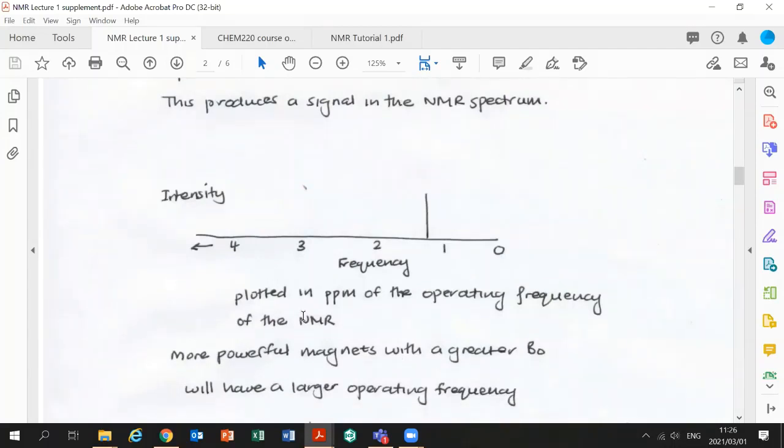So that long-winded story that I just told you just means that that's how I get a particular signal in the NMR spectrum. This arises from a proton that's excited to the beta state, relaxes to the alpha state. I get the data in terms of the free induction decay, which tells me how the energy changes over time. I convert that to a frequency in hertz, right? And that's how I get a signal. I plot it as a function of intensity on this particular NMR spectrum, and that's how I get a particular signal on an NMR spectrum.